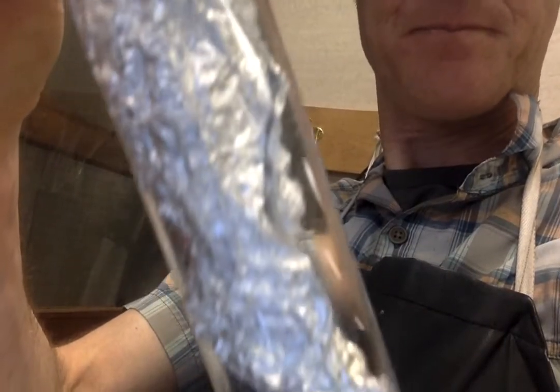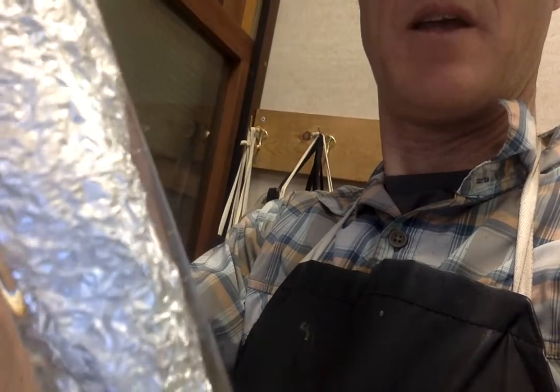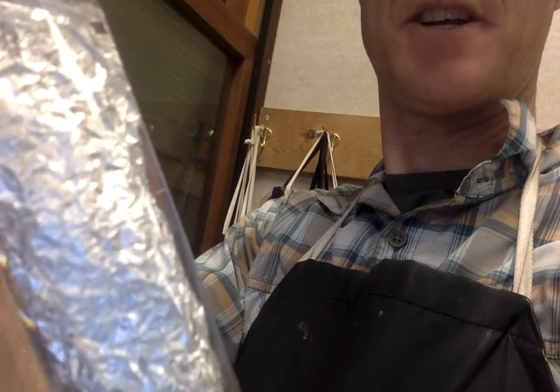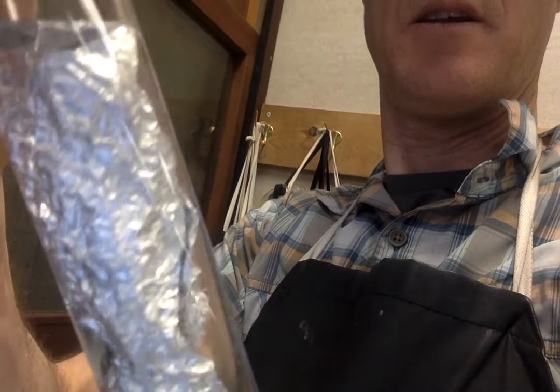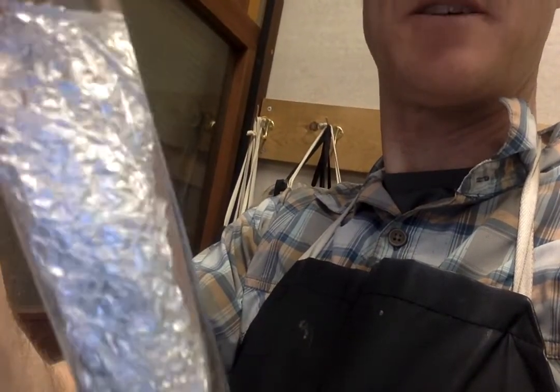Here we're seeing the aluminum. This is an interesting one. It's kind of tricky as well. I added it to 6 molar acid. Saw a pretty powerful reaction. Now with the 3 molar acid, not really sure if there's anything going on.